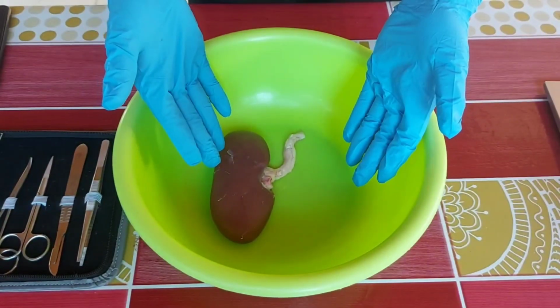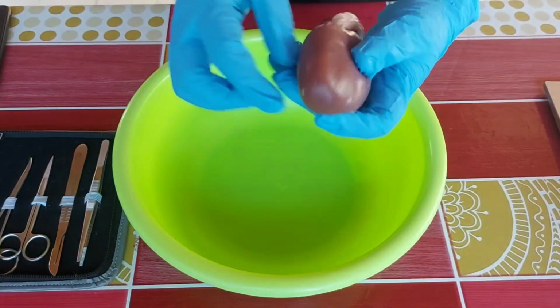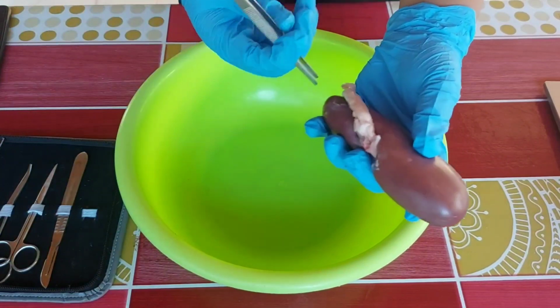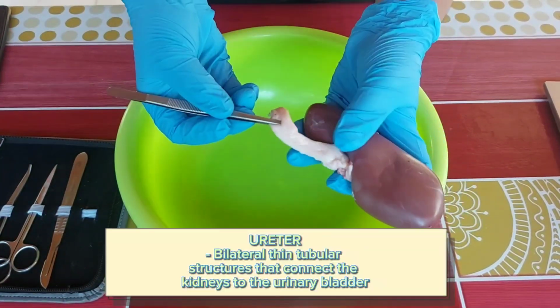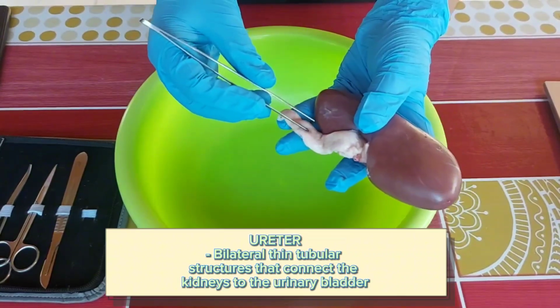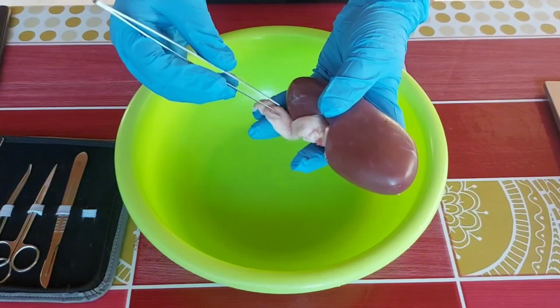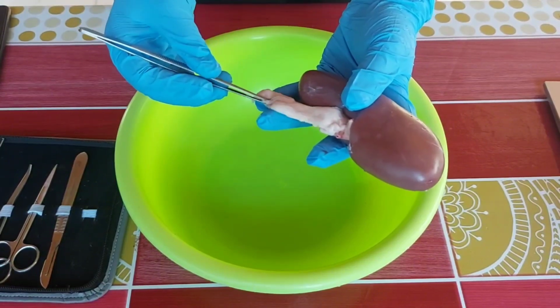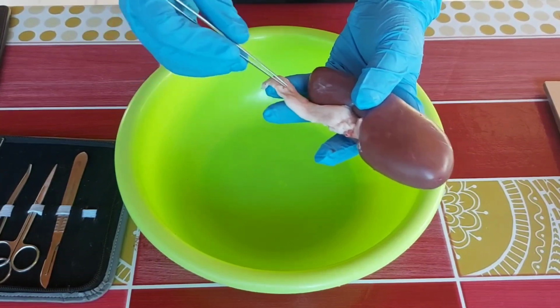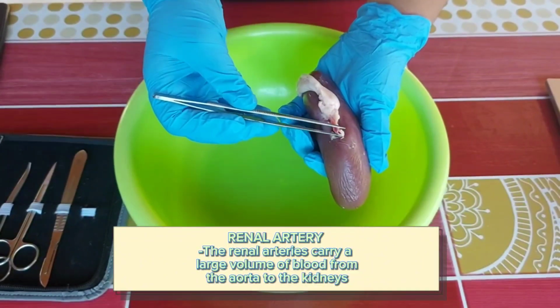So now, let's examine the outside of the kidney. This is the ureter. The ureters are bilateral thin tubular structures that connect the kidneys to the urinary bladder, transporting urine from the renal pelvis into the bladder. The muscular layers are responsible for the peristaltic activity that the ureter uses to move the urine from the kidneys to the bladder.